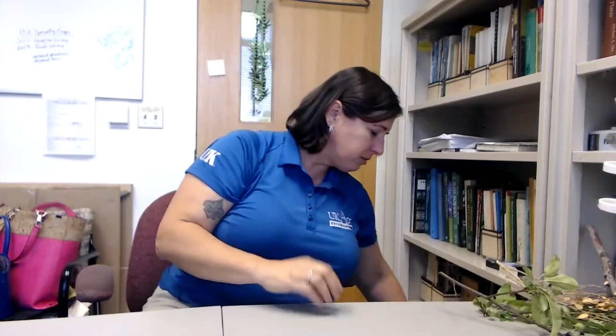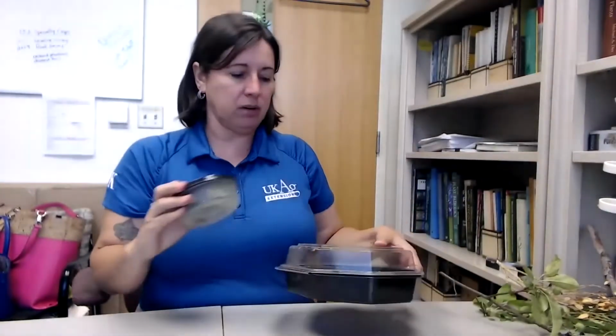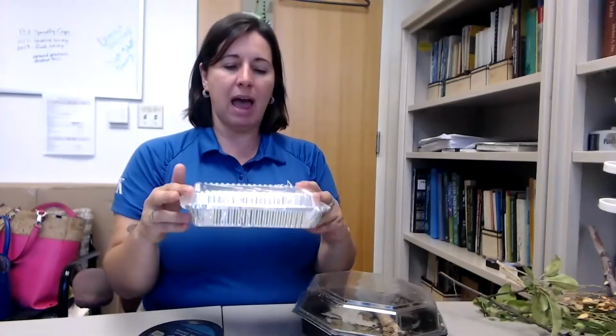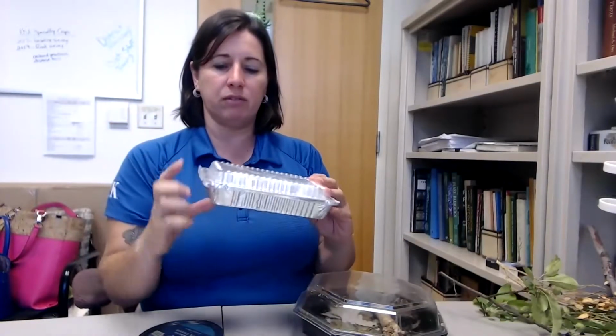We're supposed to be talking today about advanced tools. I'll give you one that's maybe not quite so advanced, a moist chamber. This is one of my favorite tools. This is a deli container. I use a lot of deli containers, and just anything with a lid. A Ziploc bag works as well, but I like something kind of rigid.